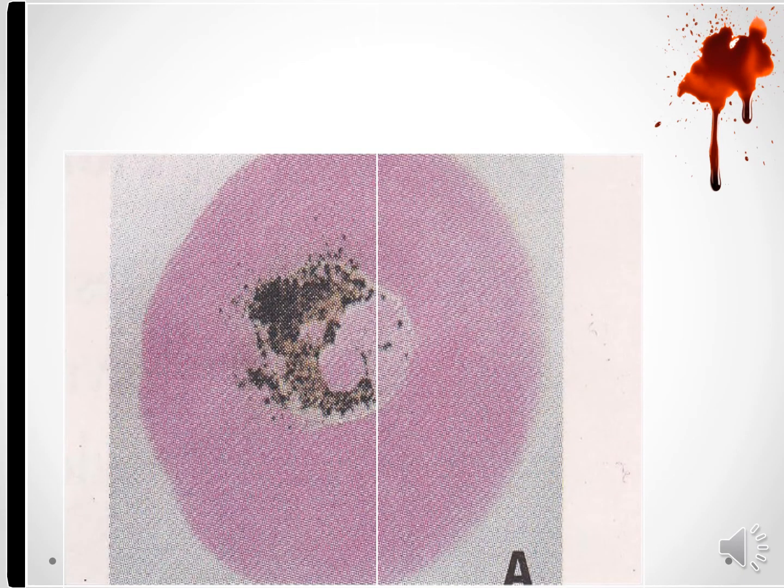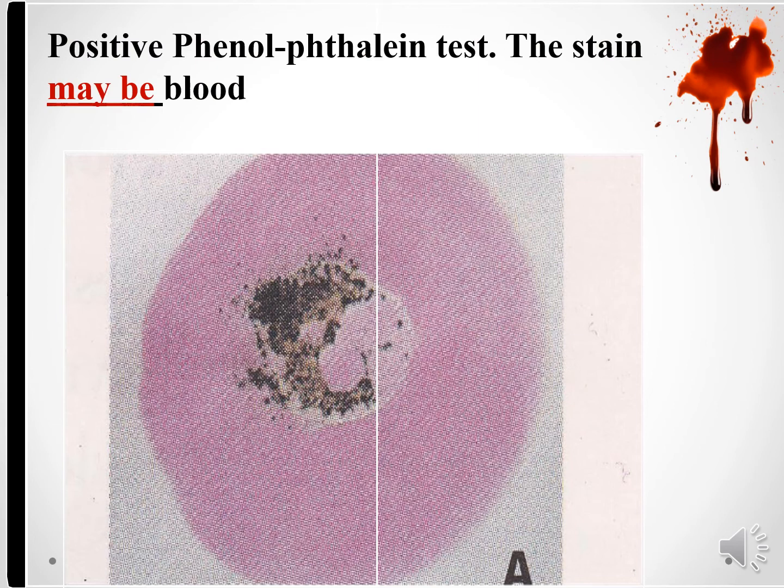This is a positive phenolphthalein test. The stain may be blood.